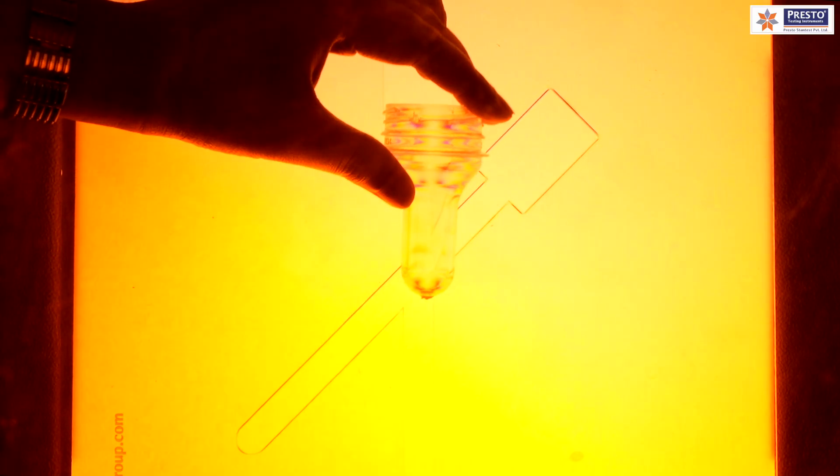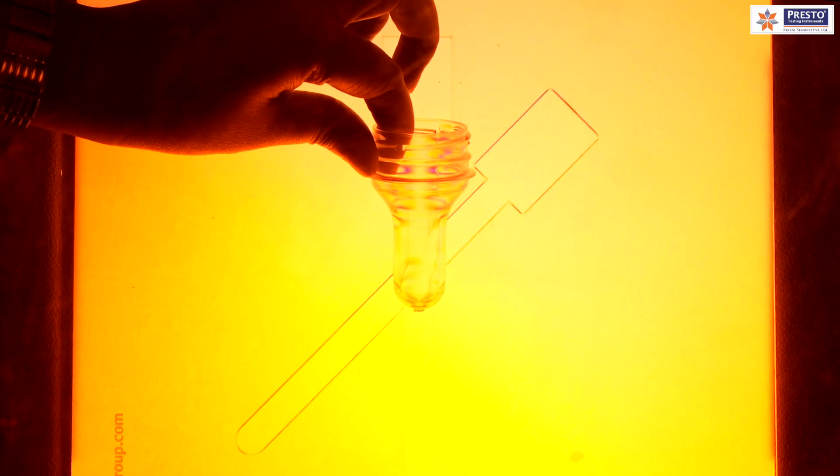Now let me show you how a non-optimum sample looks — something we cannot see through our naked eyes. Placing it here at 90-degree orientation, we can see that the stress has distributed a lot on this particular surface, which was not visible in the larger preform. This is how a non-optimum sample looks: there is a lot of stress concentrated on this particular surface.